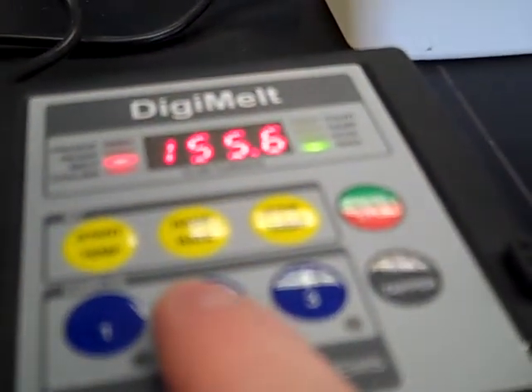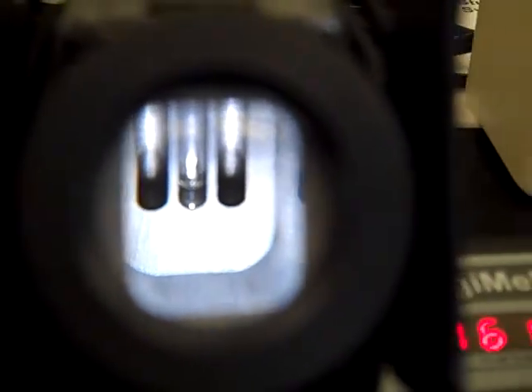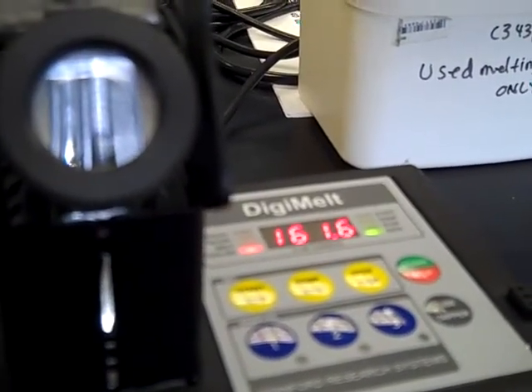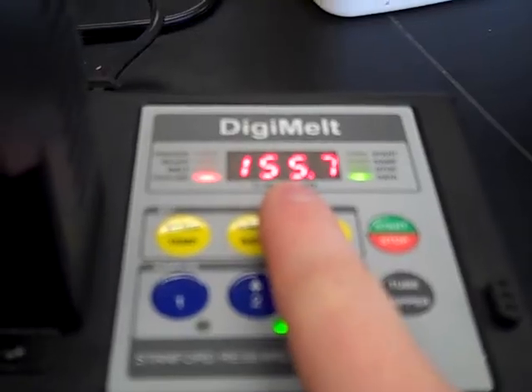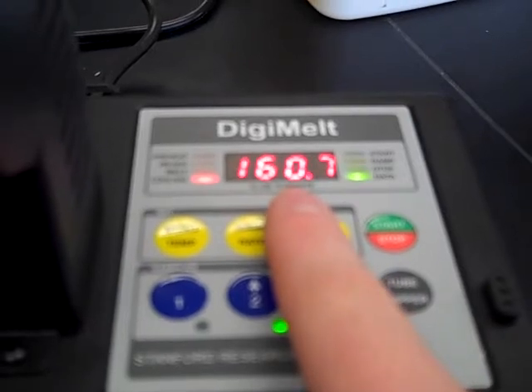At this point I see my first drop of liquid, so I press number two to record that temperature. Then I wait until it melts all the way — at this point the sample is all liquid, so I hit number two again. Once the process has stopped, I click start/stop, which starts cooling down the apparatus. Once it's cooling, I click number two to get my recorded values. The beginning of my melting point range was 155 degrees and the end was 160.7 degrees, giving me my range.